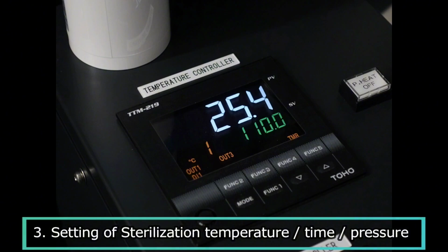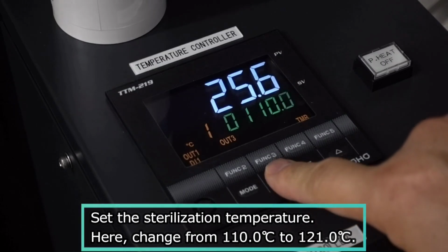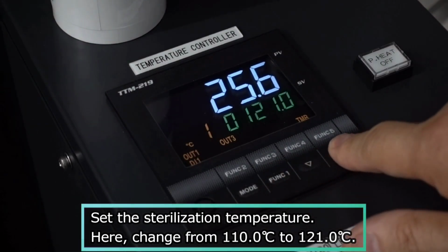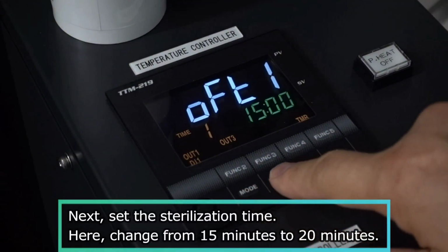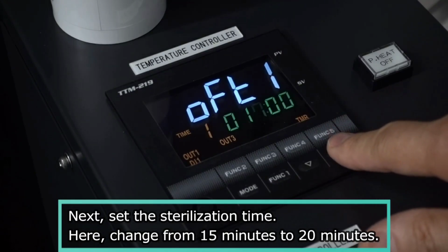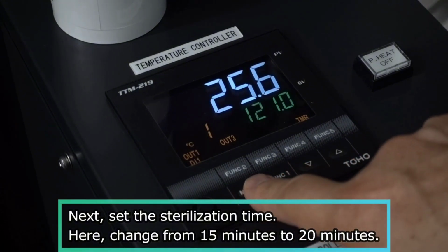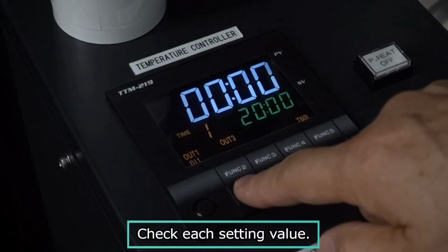Setting of sterilization temperature, time/pressure. Set the sterilization temperature. Here, change from 110.0 degrees Celsius to 121.0 degrees Celsius. Next, set the sterilization time. Here, change from 15 minutes to 20 minutes. Check each setting value.